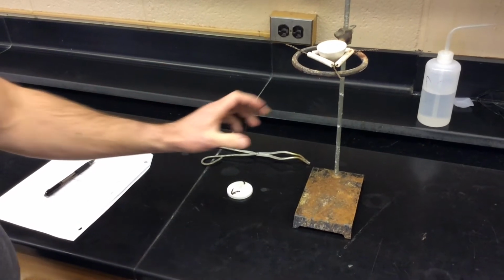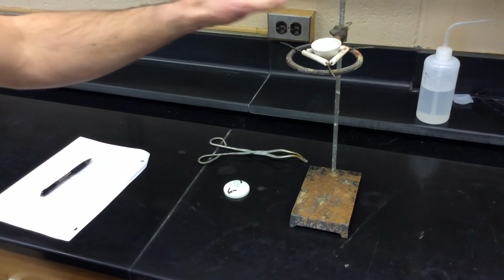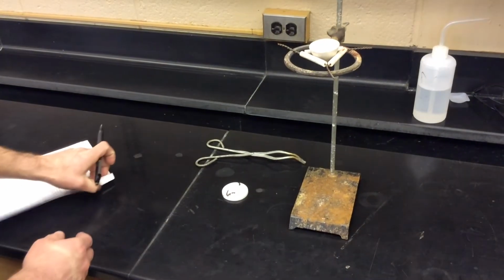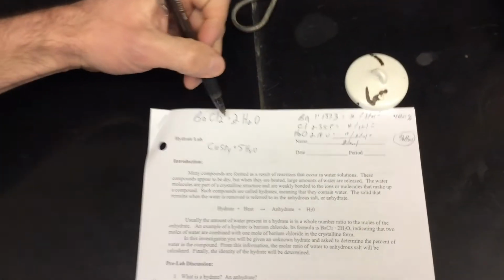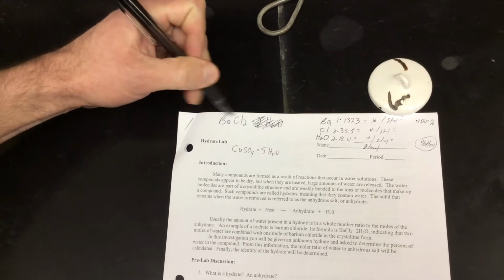When we do this, you're going to heat it up. So you have a Bunsen burner underneath, and you're going to heat up the crucible. The water is going to evaporate, and what you're left with is going to be the anhydrous salt. The anhydrous salt in this case is just BaCl2, right? Because all of that water gets evaporated. That's the anhydrous salt. And then we can figure out how much water was in there by weight.